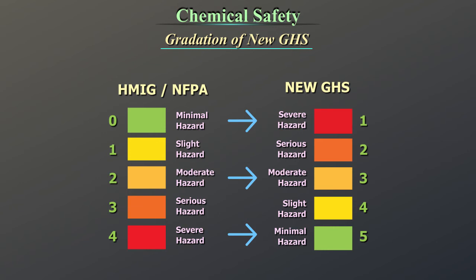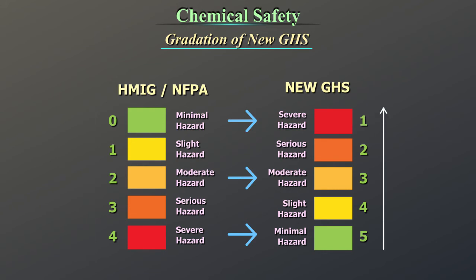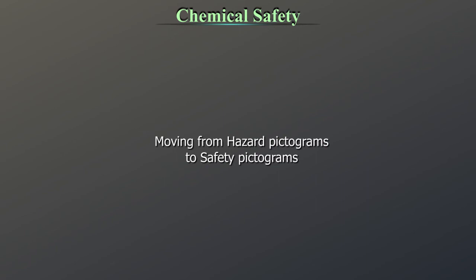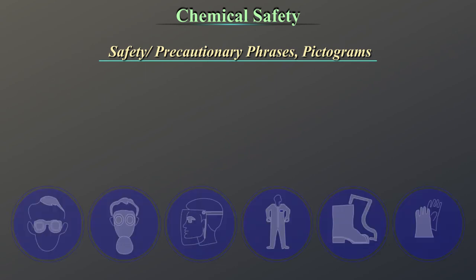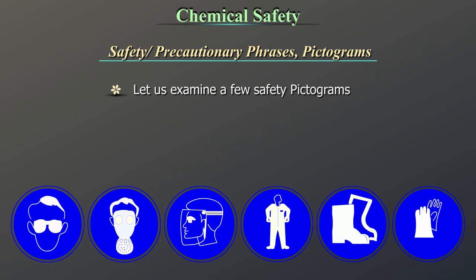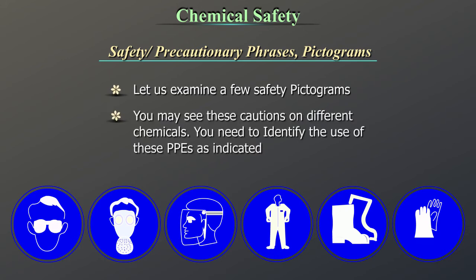Gradation of the new GHS: The new GHS differs in its gradations from HMIG and NFPA. When HMIG and NFPA classify green to red as 0 to 4, GHS classifies it in the other direction — green to red is 5 to 1. Moving from hazard pictograms to safety pictograms: let us examine a few safety pictograms. You may see these cautions on different chemicals, and you need to identify the use of these PPEs as indicated.